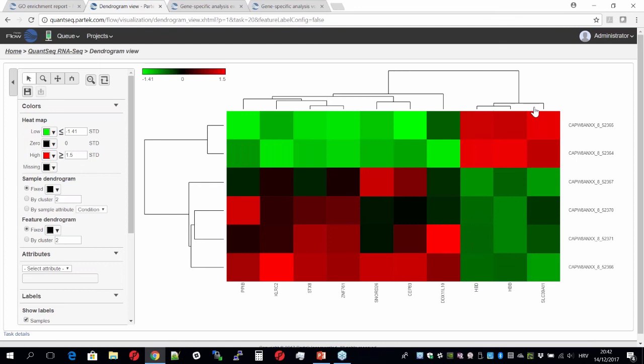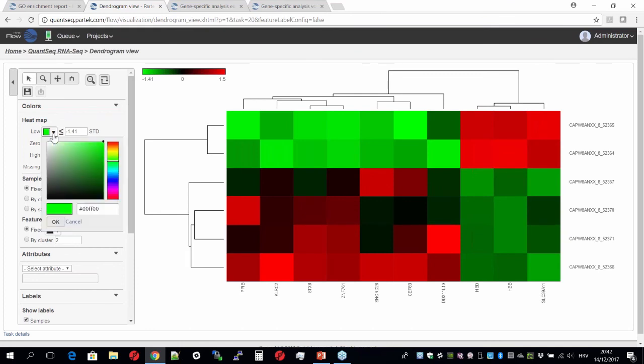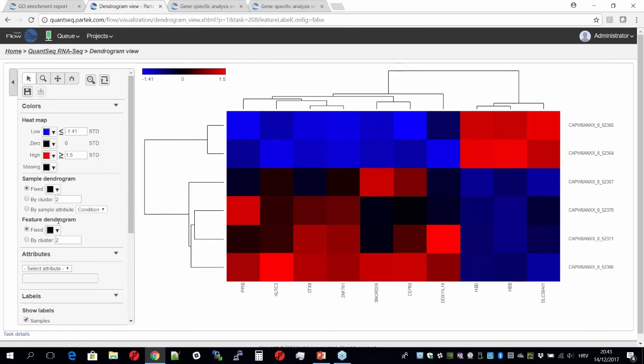You know by now that all our charts can be extensively customized. For example, let me first change the color scheme. Instead of green, I want to depict the down-regulated genes in blue. Like this, controls are on the left, pick blue, and OK. We see the sample IDs on the right, and instead of those, I want to annotate the chart by group labels.